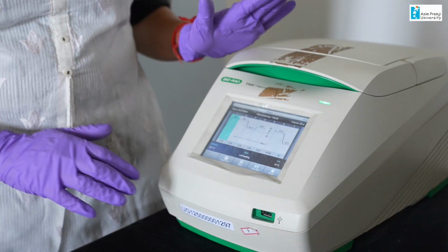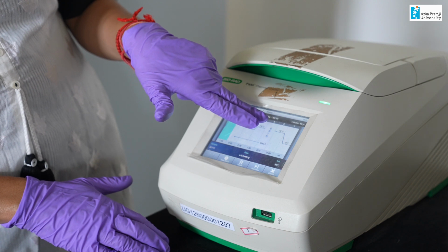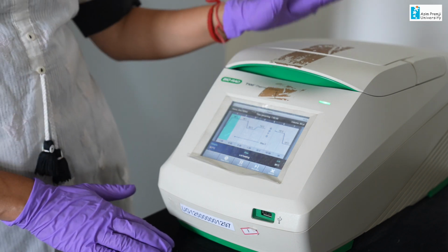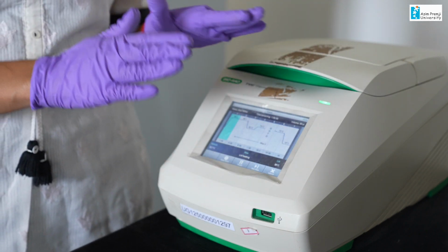That is it, you do not have to do anything else. You can see here, now it takes around 1 hour 58 minutes 59 seconds, that is approximately 2 hours. So, after 2 hours I have to come back and take out the sample, then load it on the gel.